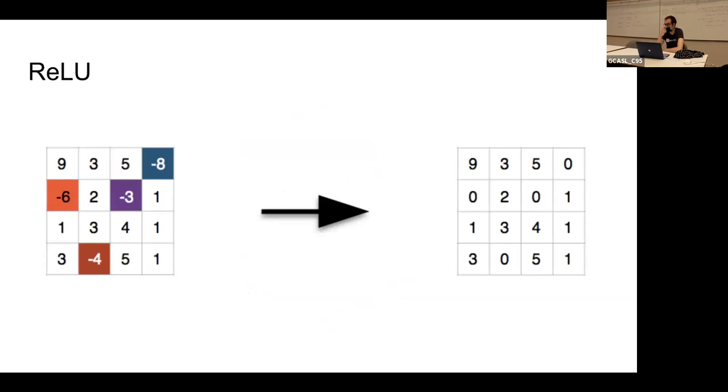But crucially, in neural networks, we include nonlinearities. This is a cartoon depiction of the nonlinearity we typically use in denoising, the rectified linear unit, which takes each entry put into it and sets the negative ones to zero. So it's a very dumb nonlinearity, nothing sophisticated about it. Something quite nice about it is that taking the gradient is very easy, because it's just zero and then linear.